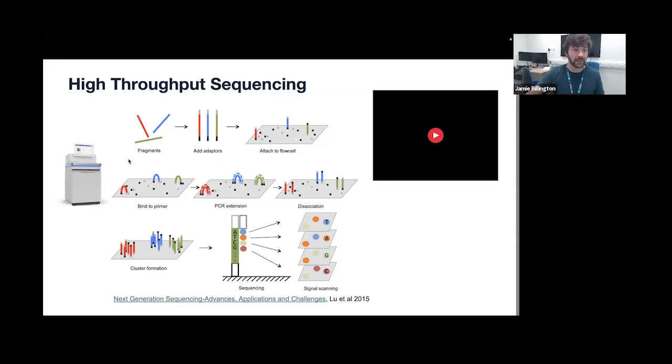And then basically, if you're familiar with molecular biology, we're going to perform PCR reactions, but in a spatially localized manner. Given that the pieces of DNA we want to sequence are anchored by adapters, any PCR extensions will create child pieces of DNA which are located near to their parent. Through an iterative process of amplification, you end up with clusters of DNA sequences where each sequence in the cluster has the same base sequence. This is important because it's essentially like multiple replicates of a DNA sequence, which gives a strong signal in the reaction we use to call bases.